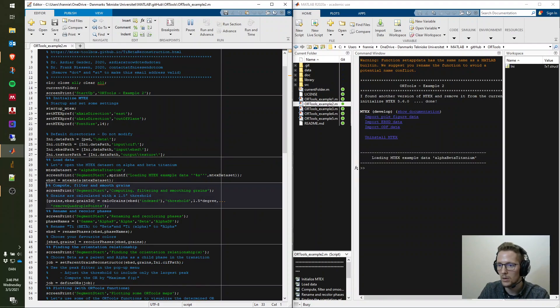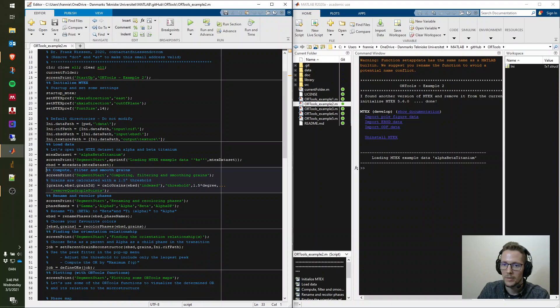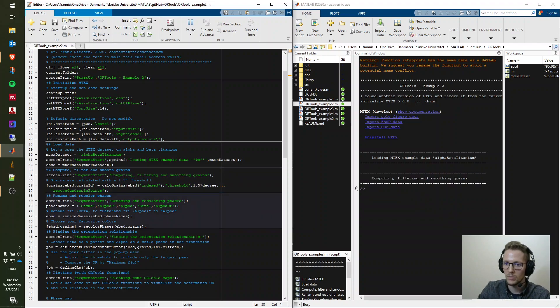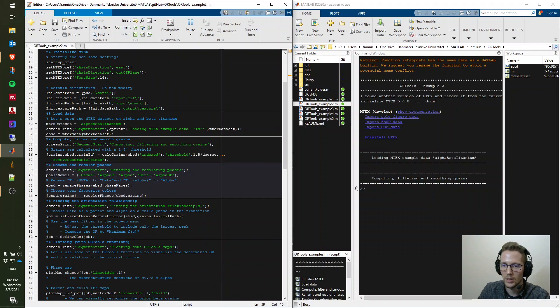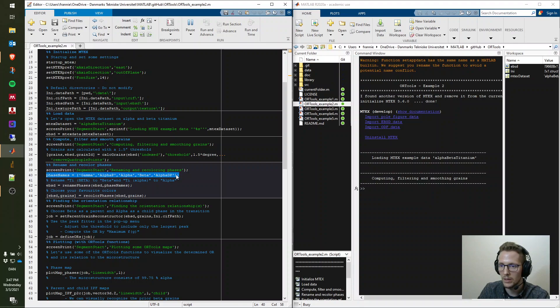The loaded dataset is the MTEX alpha-beta titanium dataset. After loading, we calculate the grains using a threshold of 1.5 degrees — nothing unusual there. In the next step we rename and recolor the phases: you can put any phases into the cell array that you'd like to consider and then assign names to those phases.